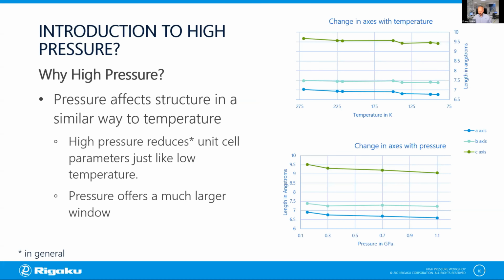And I'm sure that a lot of the people in the audience, if they've not done high pressure, they probably have done something with high temperature or low temperature or somewhere in between, and doing a range of the structures across these temperature ranges. And you'll know that changes the phases and things like this of this structure. So the same is also true for pressure. Often the reason that you'll do it is simply because you want to explore those phases and the changes.